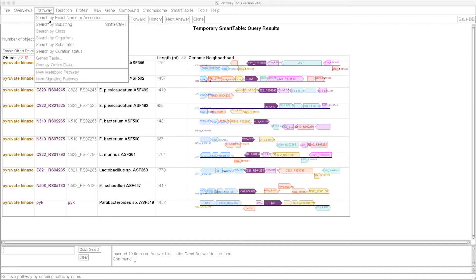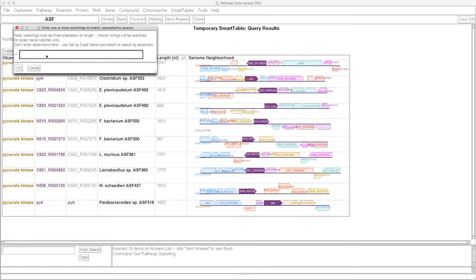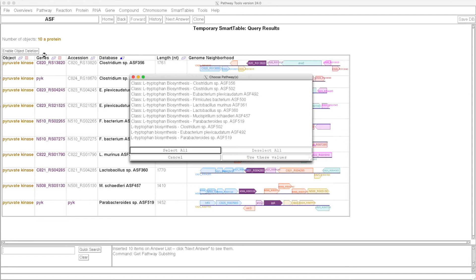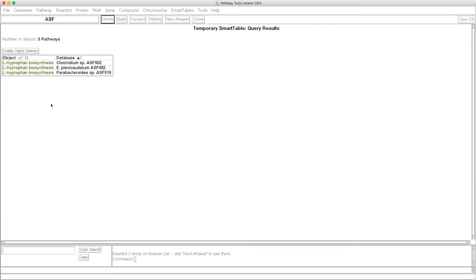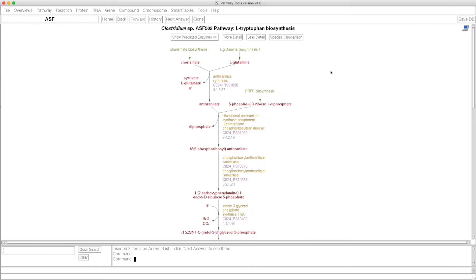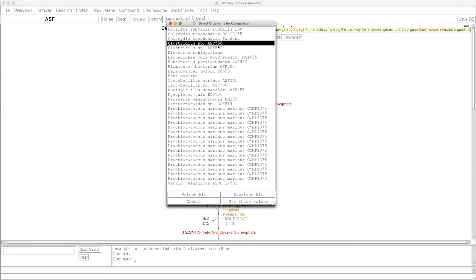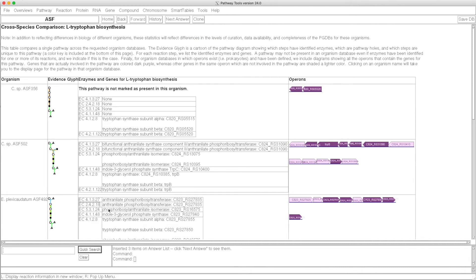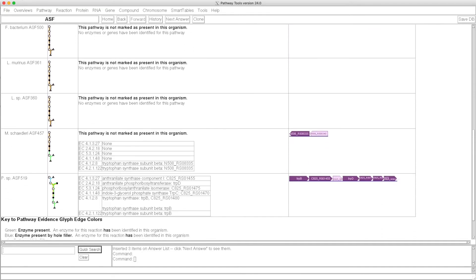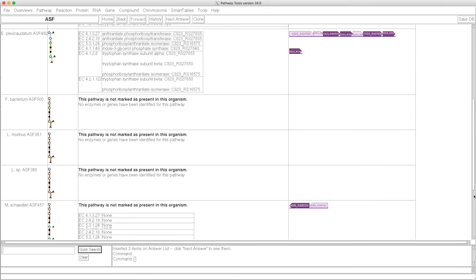We can also search for pathways. I'm going to do a substring search for pathways. I'm going to search for tryptophan biosynthesis, see which organisms have that. We see three organisms have tryptophan biosynthesis listed here. I can click on one of them to see the pathway in just that organism, and then I can ask for a species comparison across all the ASF organisms. We got a table summarizing which organisms the pathway is present in. It's actually present in this one, but not present in this one, even though two of the enzymes are present. The full pathway was not predicted as present because there was too little evidence. And we see the operon organization as well in each of the organisms containing it.